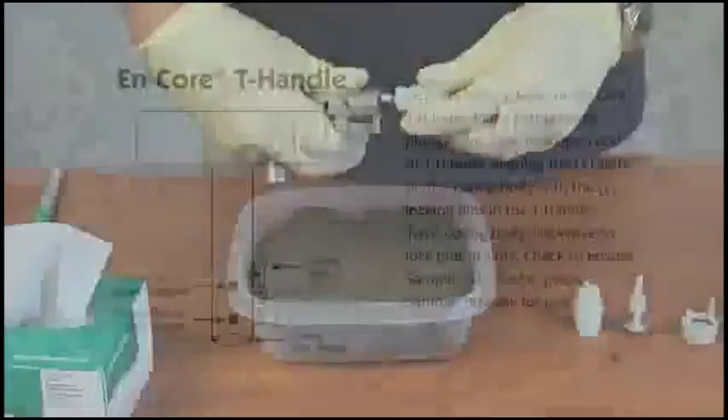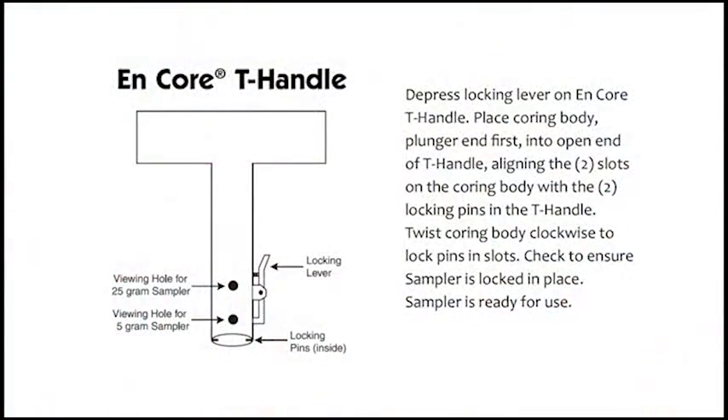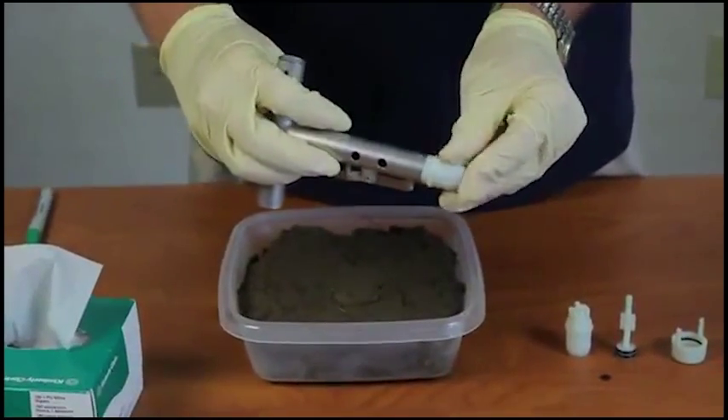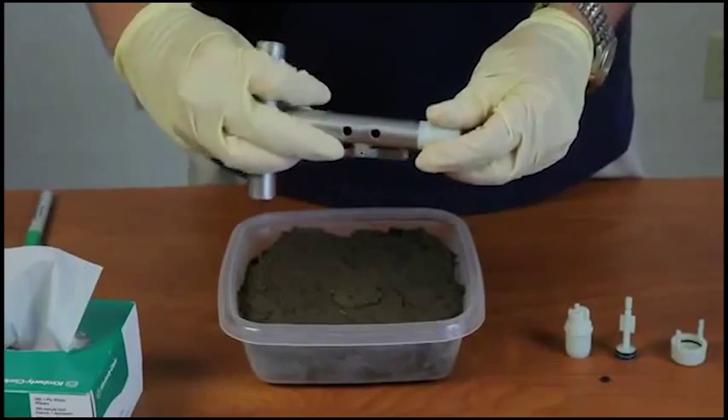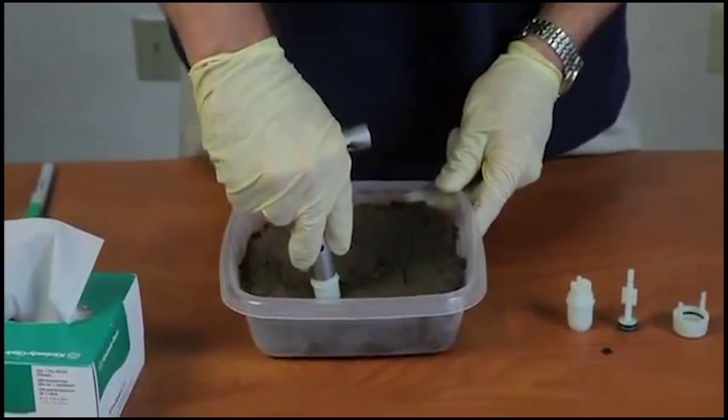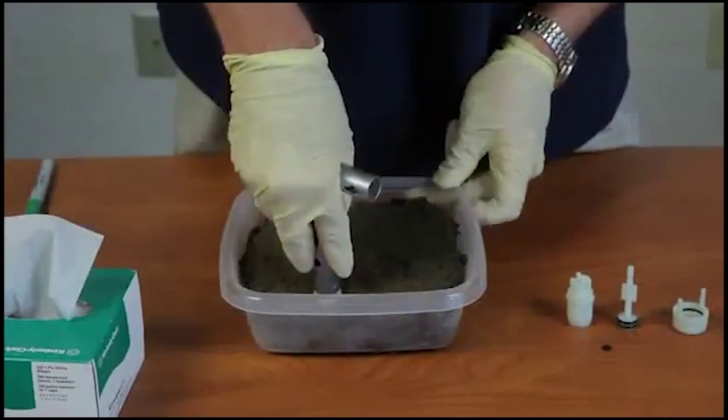This is your T-handle. Put it in your T-handle — you hear it snap in. You want to check to make sure that it is tight in there. You want to take a sample from freshly exposed soil.